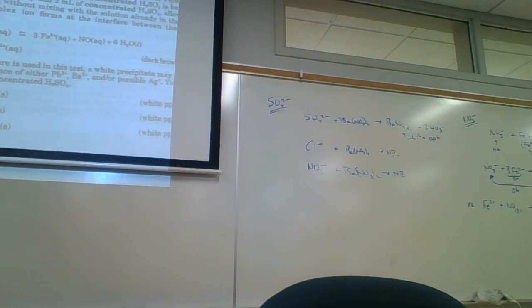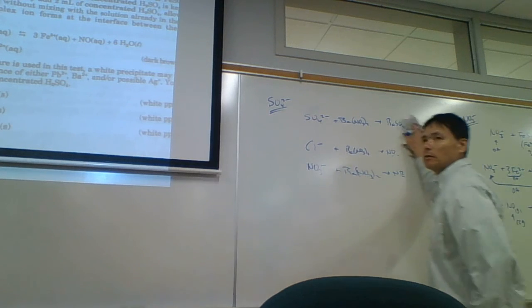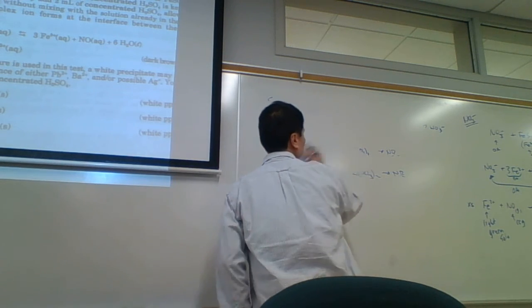This is a CCG. This is light green. So this is light green solution. And so what we're going to do is go from light green solution and then the CCG, a clear colorless gas, to this. This is going to be a dark brown solution. Dark brown solution.